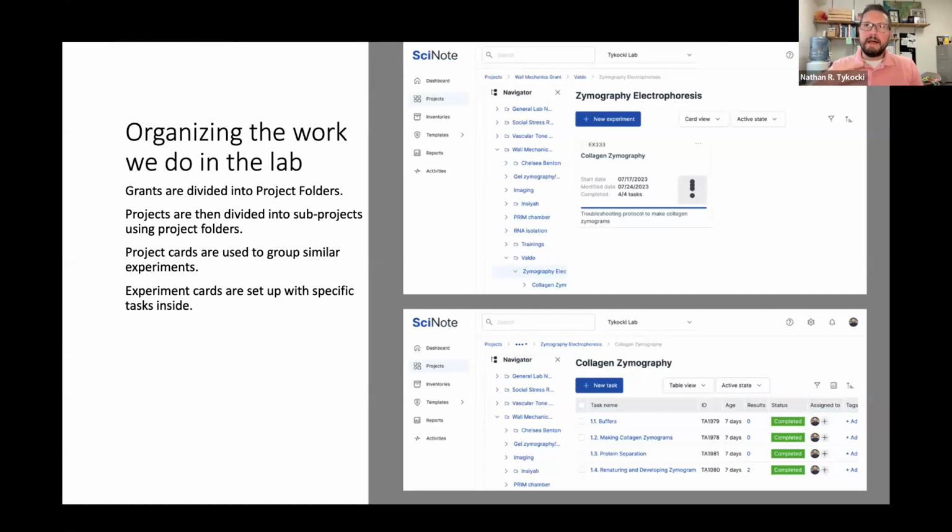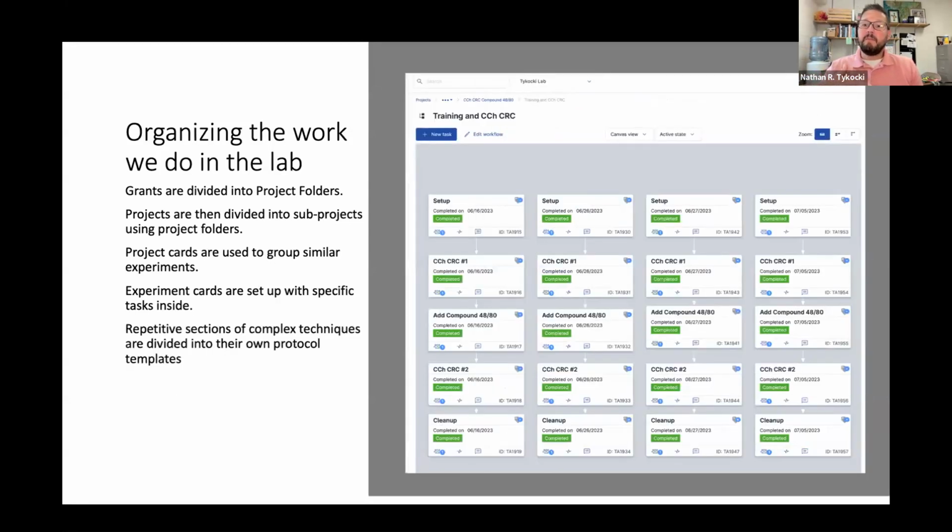So we use a lot of techniques in my lab, and we use a lot of them in multiple ways. For example, isolated tissue bath studies or pressure myography. Parts of those experiments are key to every single day that we do. Parts of them are variable as the day goes by. And so this is just one way that one of our new students decided to set up a series of 4 days worth of experiments, where when building our protocols, we built the different steps associated with each portion of a tissue bath experiment as a different protocol.